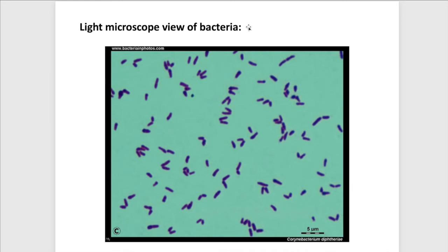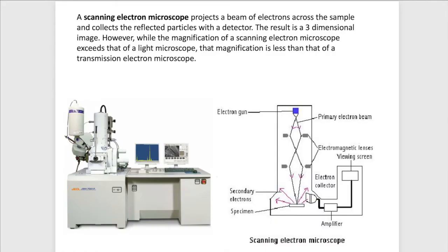So, okay, these are at the small end of the scale on which I need a different kind of microscope if I'm going to understand what it is that bacteria do. What are they up to here? Now, that other device that I can use to look at things that are too small for the light microscope is something called the scanning electron microscope. And with the scanning electron microscope, instead of using rays of light, I use rays of electrons. So I have this thing that's spraying electrons. The electrons come down here.